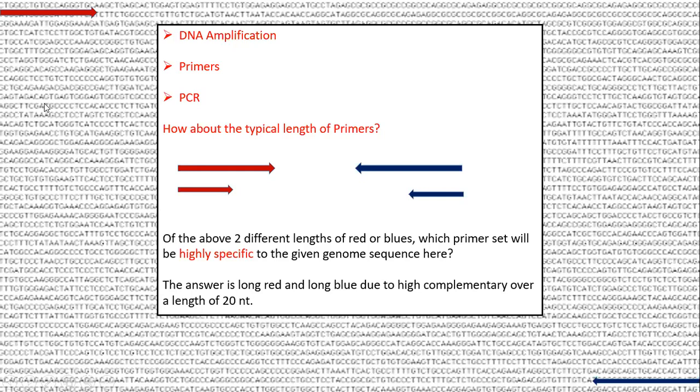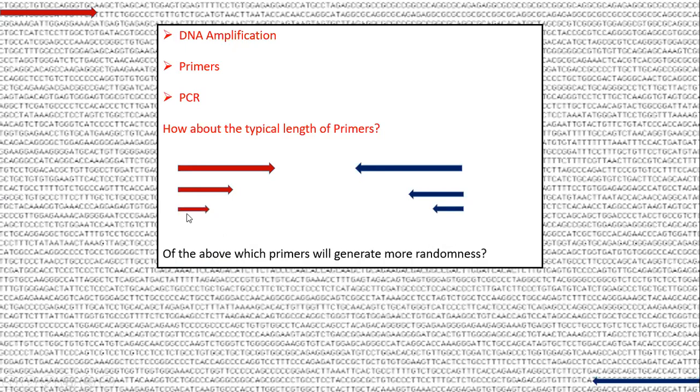So let's say it is AGTG, ACTG of this sequence. This is another sequence here. Within these 6,500 base pairs, I might have a duplicate, the same sequence, an exact copy in another location here. Because I'm shortening the DNA's nucleotide length, it may have more binding because more repetitive elements are there. Or if I make it even shorter, I may get more frequent binding of these primers, not only here and here, maybe in different locations and randomly in a given 6.5 kb. How does it happen? Just like this.